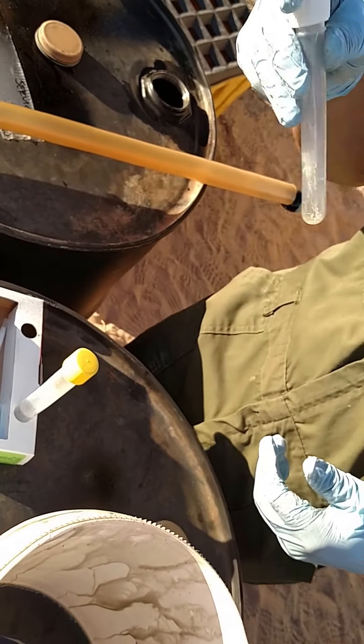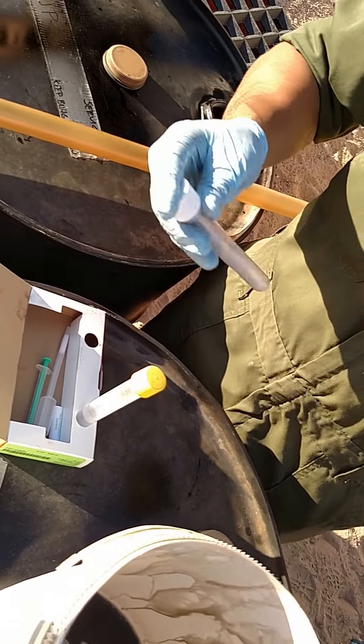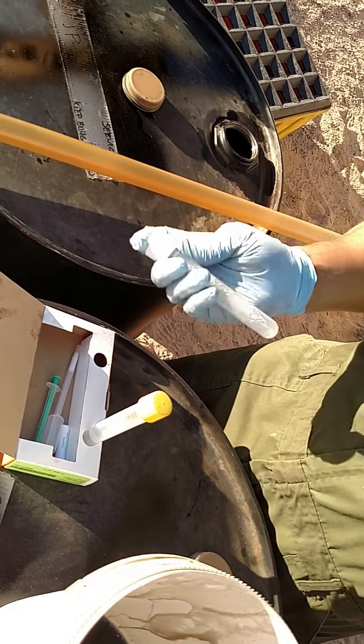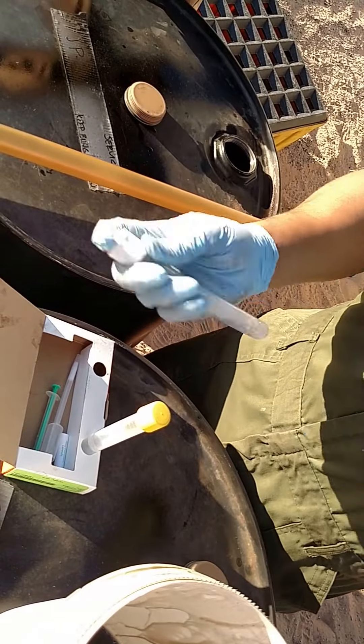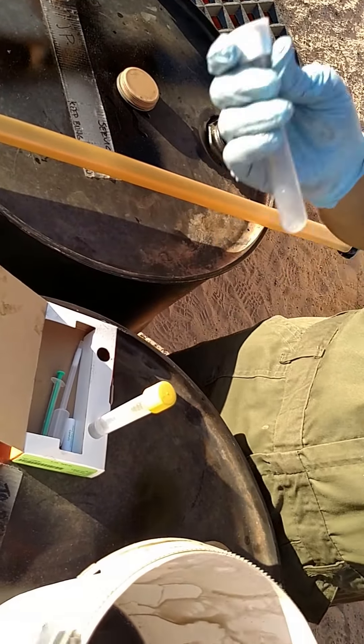Now shake it for about 30 seconds. That's a good shake right there. You got a good rhythm going, right.